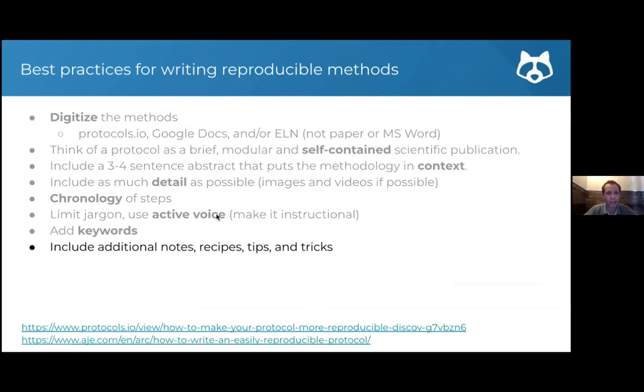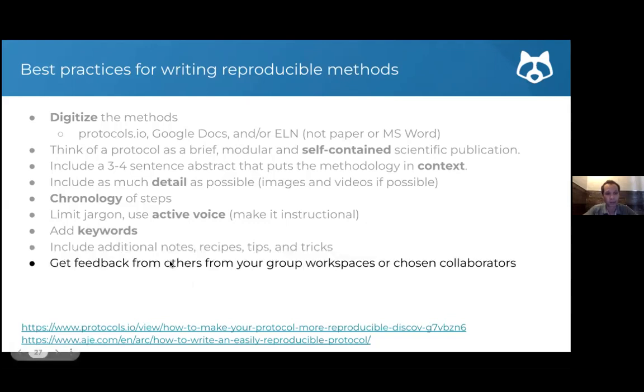And of course, hints, tips, tricks. If you've published the protocol and don't necessarily want to create a new version, but you have hints, use the comment functionality. Click on a step, add a note to it so it's on the margins. You can still run through the step-by-step crisp instructions, but for the first-time reader or an occasional user, those side note reminders can be really, really helpful to avoid mistakes.